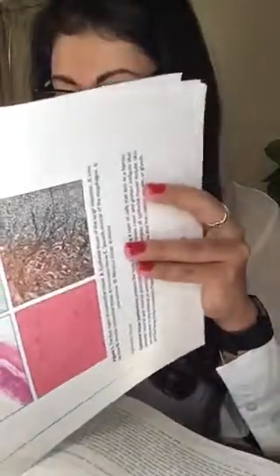Background. So there's, I would say, a lot of information. But for exercise 1, the histology and epithelial tissue, in this exercise you will review histology and different types of epithelial tissue. Procedure: open the histology slide supplement document online.